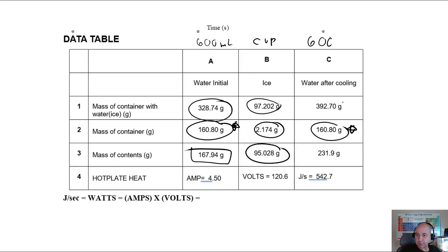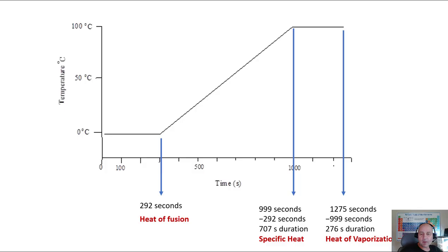And so this is the mass after boiling. Now the reason that this mass here is higher than the original mass of the beaker and the water is because we've added the ice cubes. And I think this is where most of the confusion comes from. So we have the cold water plus the ice, which we are melting. So this has to be added together. And then if you want to know the amount that you evaporated, you have to subtract this amount here, okay?